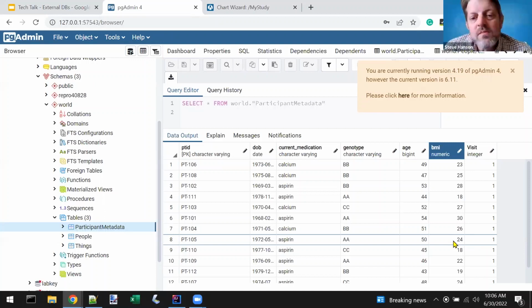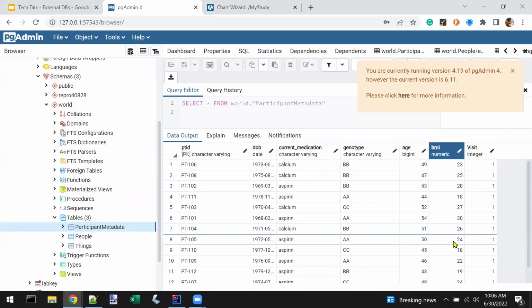Oh, so we've developed over the years a mechanism for creating incremental scripts to modify schema as functionality in the product changes. And if you like that mechanism, instead of changing your schema by hand remotely, through PG admin or something, you can create a little LabKey module that manages your schema updates. Oh, that's great. It's a nice feature. That's great. Super. Thanks. That's why you're here, Matt.